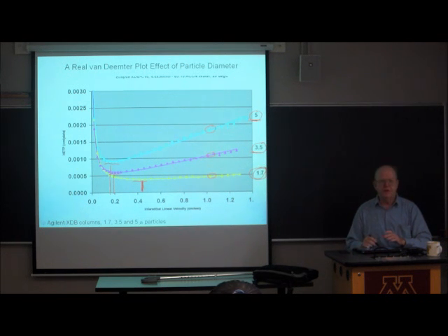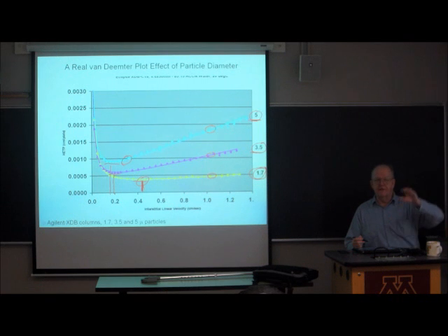This column works perfectly well with a 400 bar system, and this thing needs a 1,000 bar system to make it work. And a pump that cannot leak fluid when you apply 1,000 bar to it is a lot harder to make than a pump that only has to handle 400 bar. And that's the bottom line why it's taken that long. It took us 20 years to get from 10 micron particles to 5 micron particles.